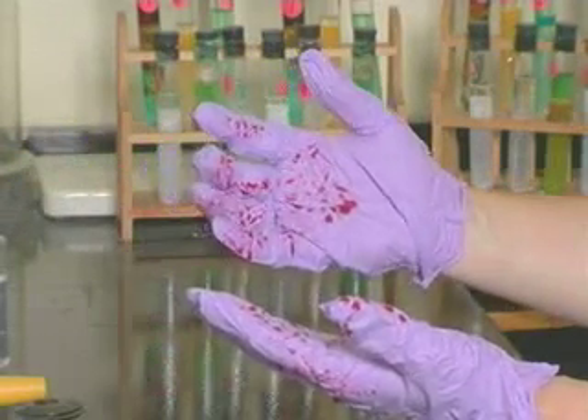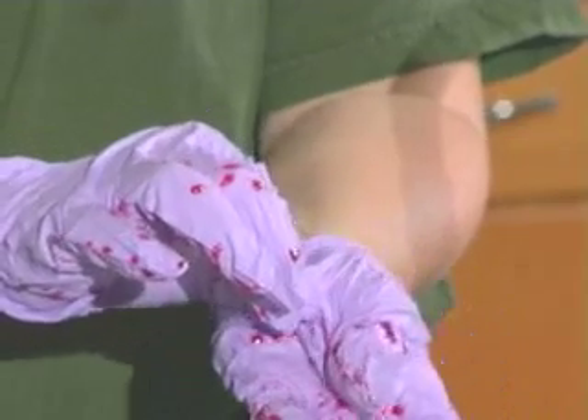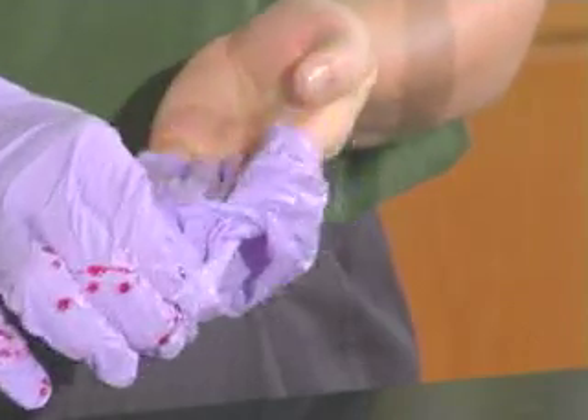Without touching your bare skin, grasp either palm with the fingers of the opposite hand. Gently pull the glove away from your palm and toward the fingers. Remove the glove inside out, and hold on to the glove that was removed with the fingers of the opposite hand.